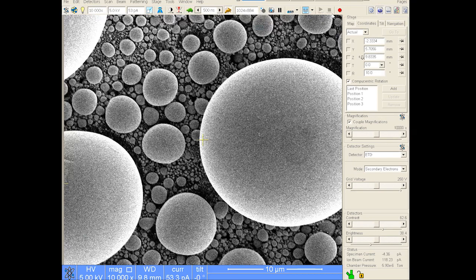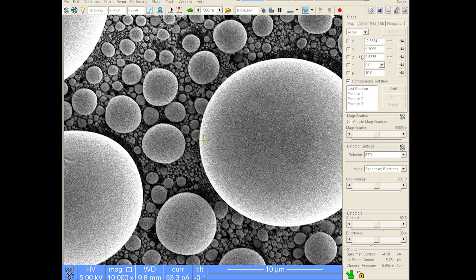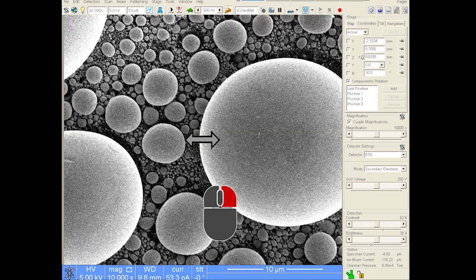The other thing you can do is use the mouse to focus. And I show this to people. Usually younger people tend to use this a lot more than the older people like me. But if you press down the right mouse button, my cursor turns into a double arrow. I guess you can't see it on the screen.